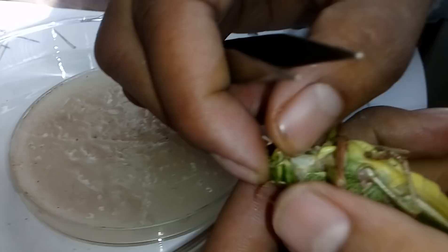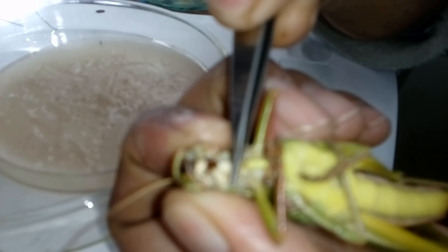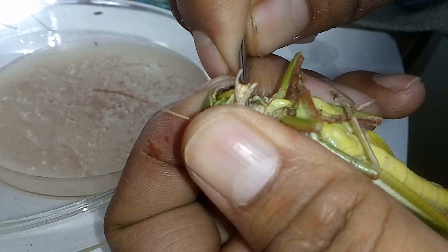Now we go for the removal of the lower lip, also known as the labium. Here this is the lower lip, and just upside of the lower lip we remove it like that. The black structure is visible here — if I pull the labium, the black structure is coming out. This is a hypopharynx-like structure. First I have to remove the lower lip or labium with the mentum carefully.